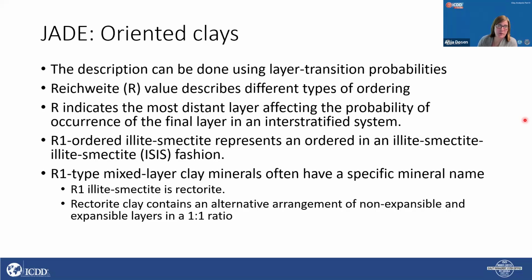both structures and parameters. Okay, so now we're getting into something a bit abstract, but just bear with me. So how we model oriented clays: we do that using the layer transition probabilities.